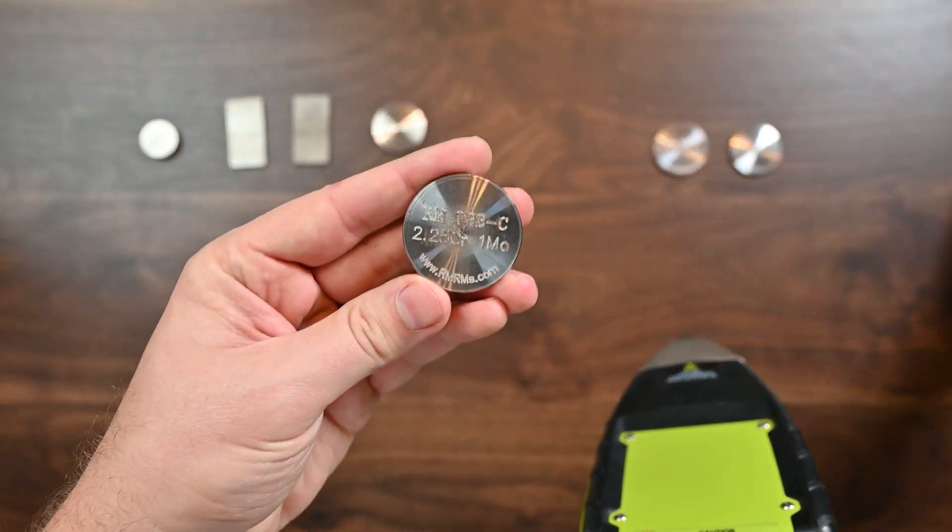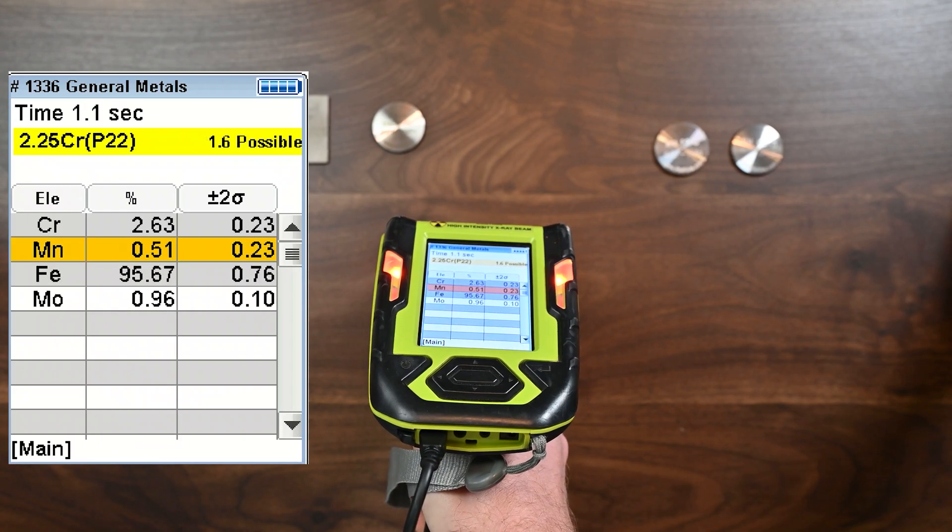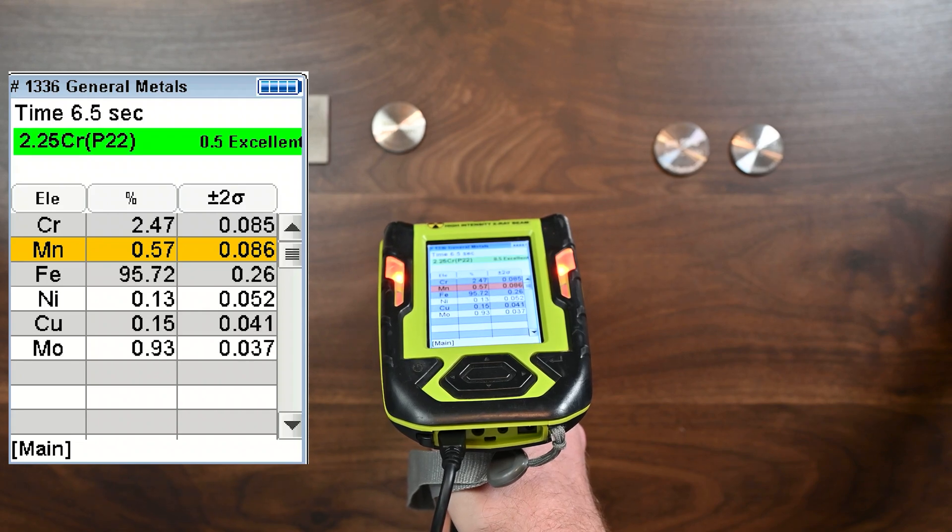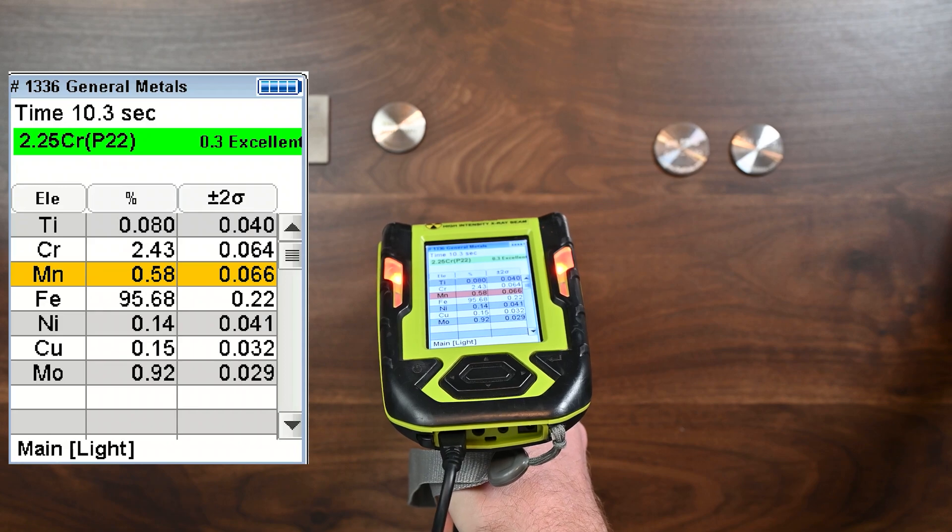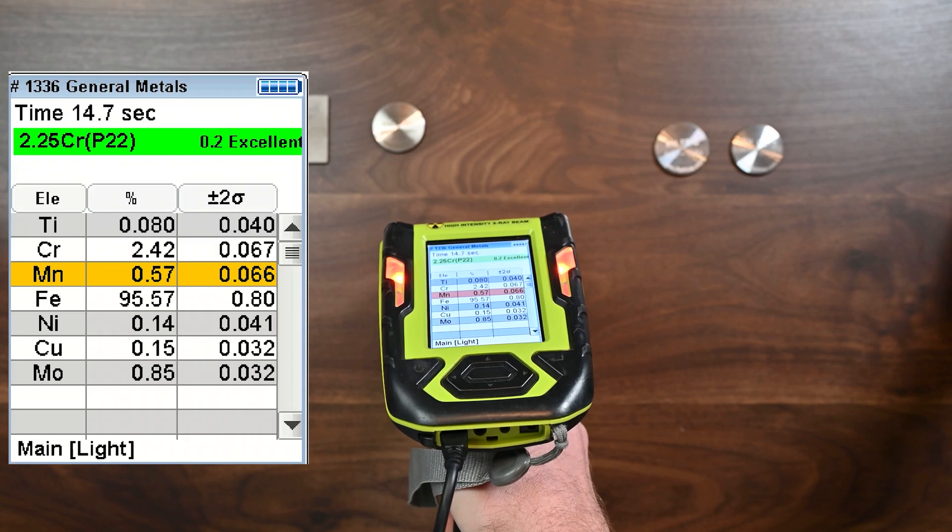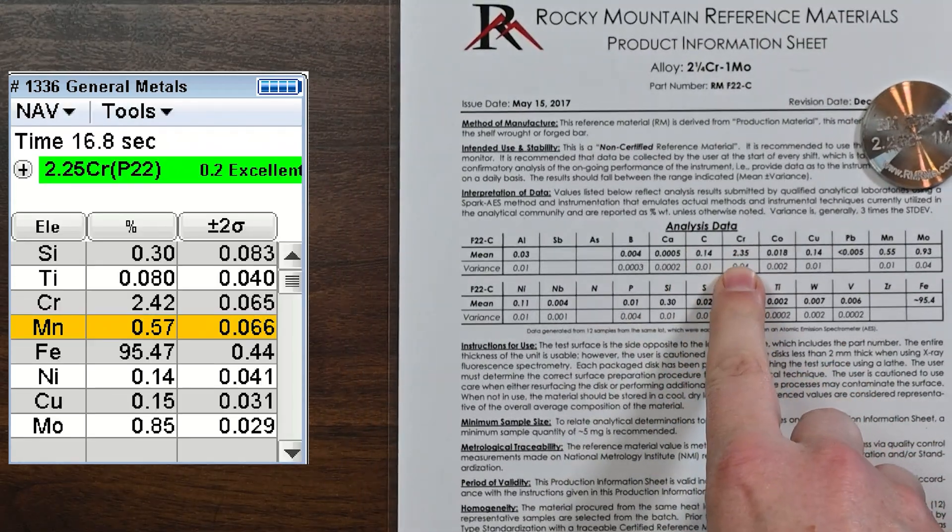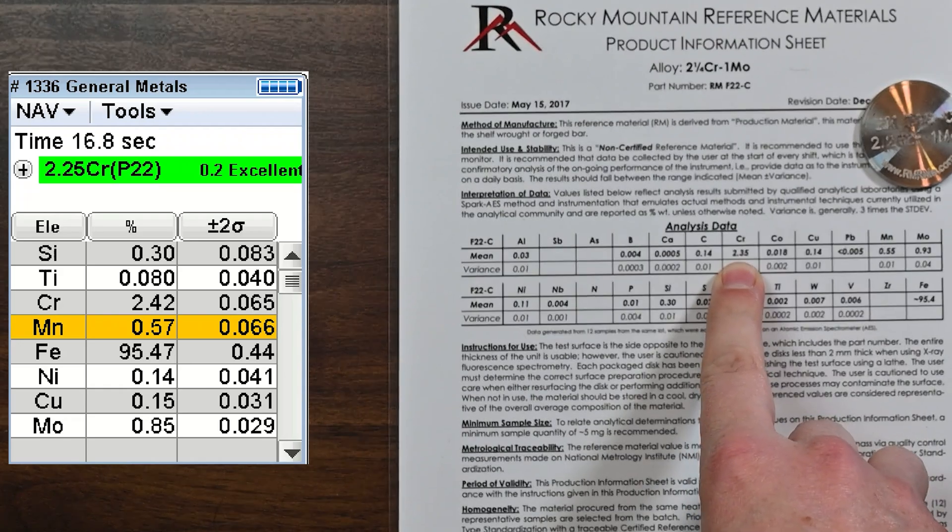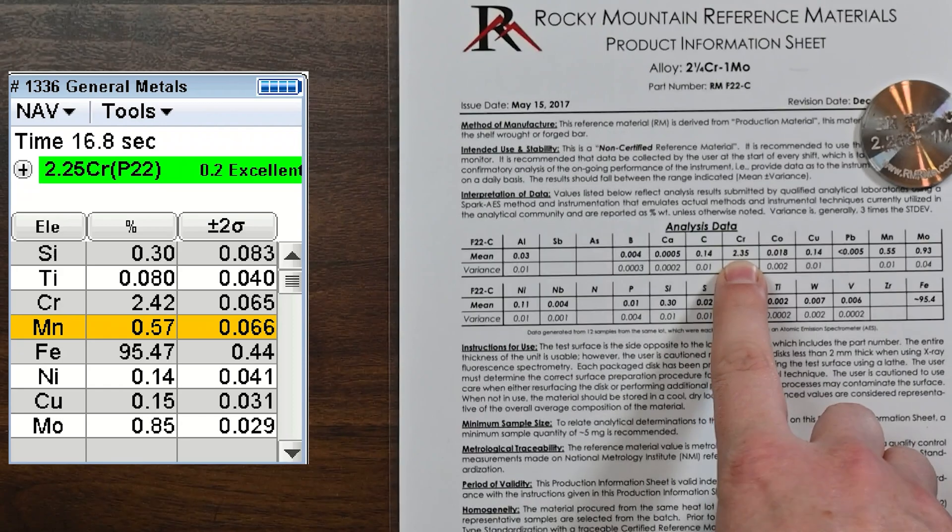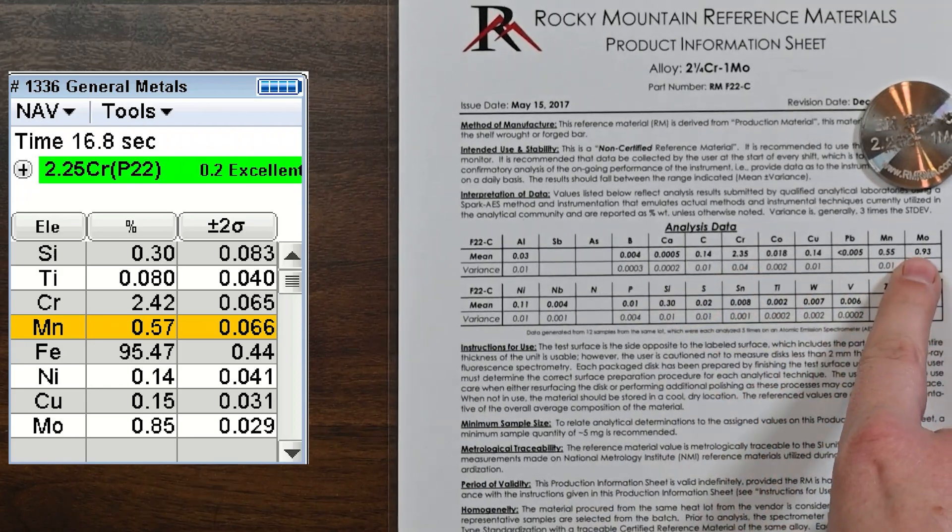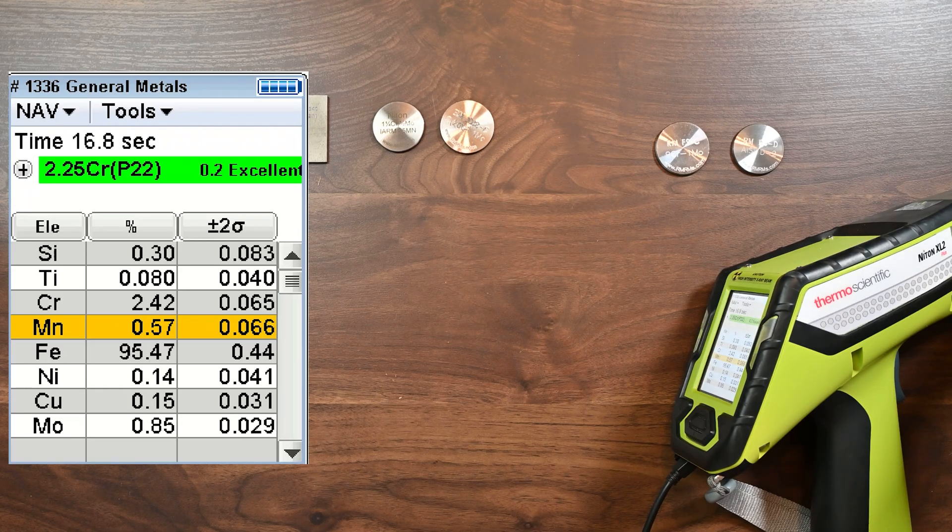So now we've got this two and a quarter chrome, one molly. Now that's just the name of the alloy, so keep in mind that it's going to be an approximate chemistry. So we're going to run this. See it beeps right away again, that one second to get the great identification. Really great. And then I'm going to let it run. I have it set up right now for 10 seconds. It's going to kick the light element beam on. So now the light element beam is on. I only really want to run that for a couple of seconds because I don't want to bore you guys. So let's take a look at this chemical breakdown now. So the two and a quarter chrome, one molly, right? So if we look here, our certified chrome is at 2.35 and we read 2.42. And we didn't even do a full analysis. I mean, really we could do a much longer analysis, but that's pretty much as spot on as you're going to get for a handheld XRF. And really, again, the great identification is one second is great. So now we're going to look at that molly. 0.93 is the certified value and I'm reading at 0.85. So again, really great precision calibrations from Niton. They're usually really spot on.